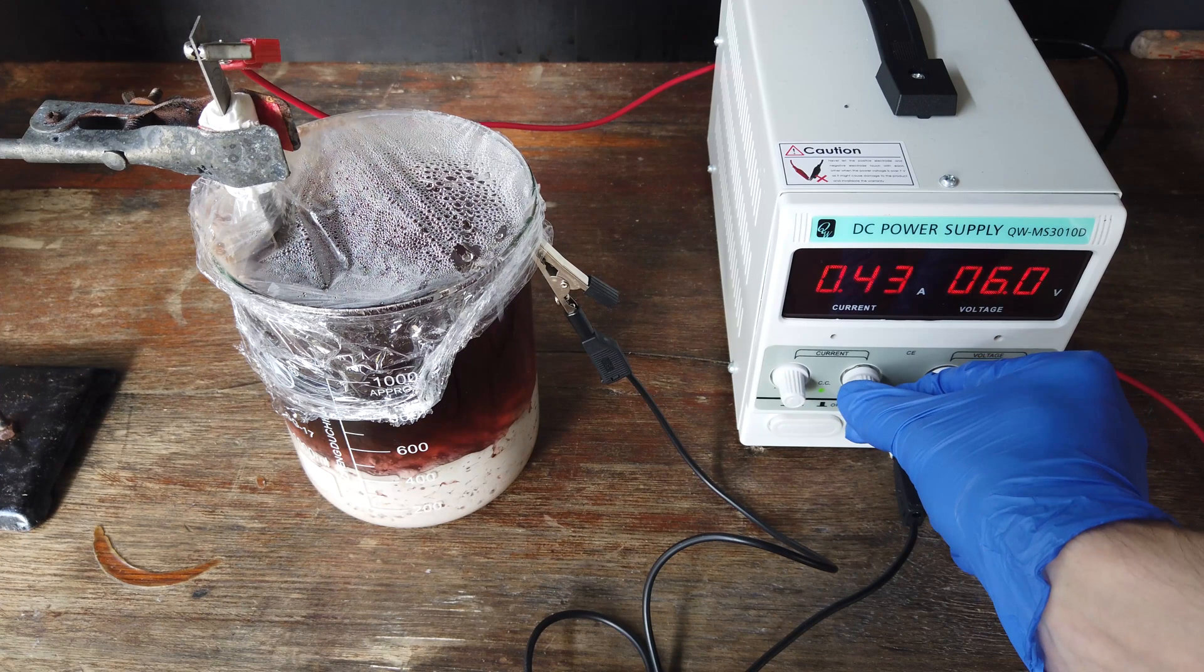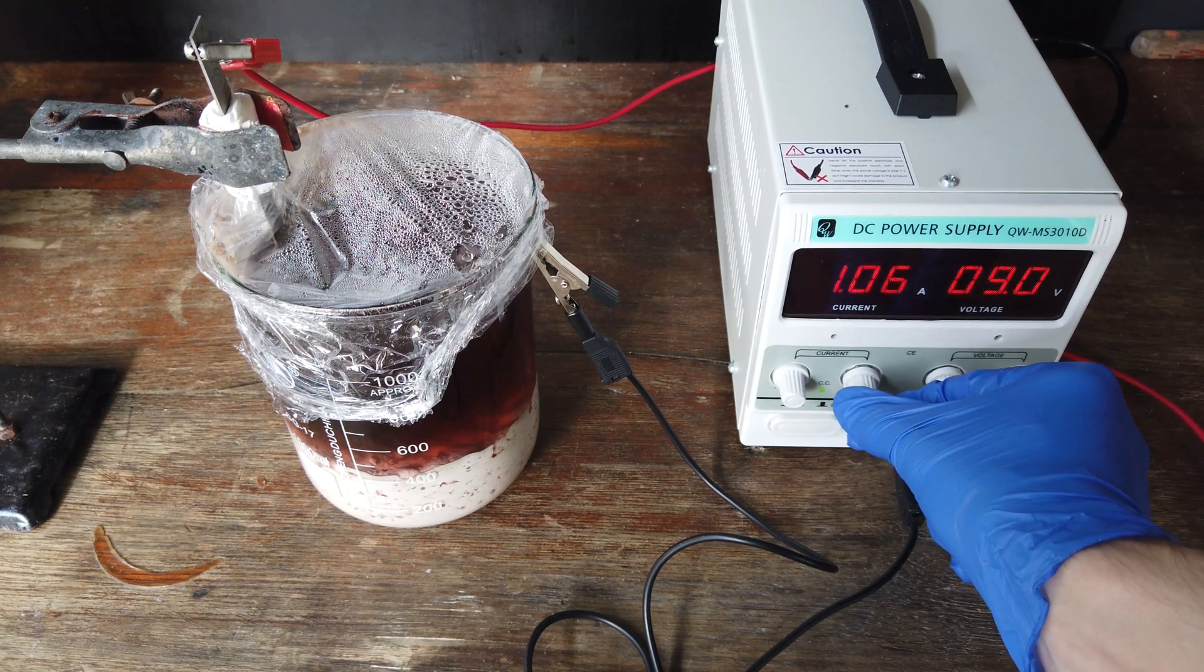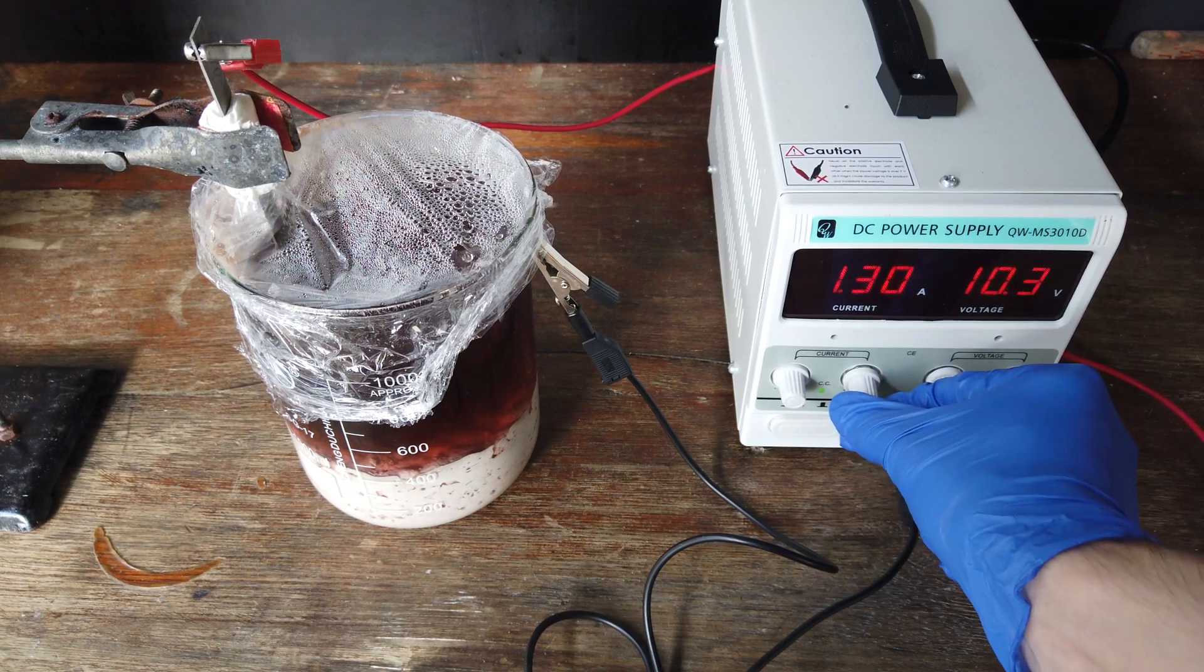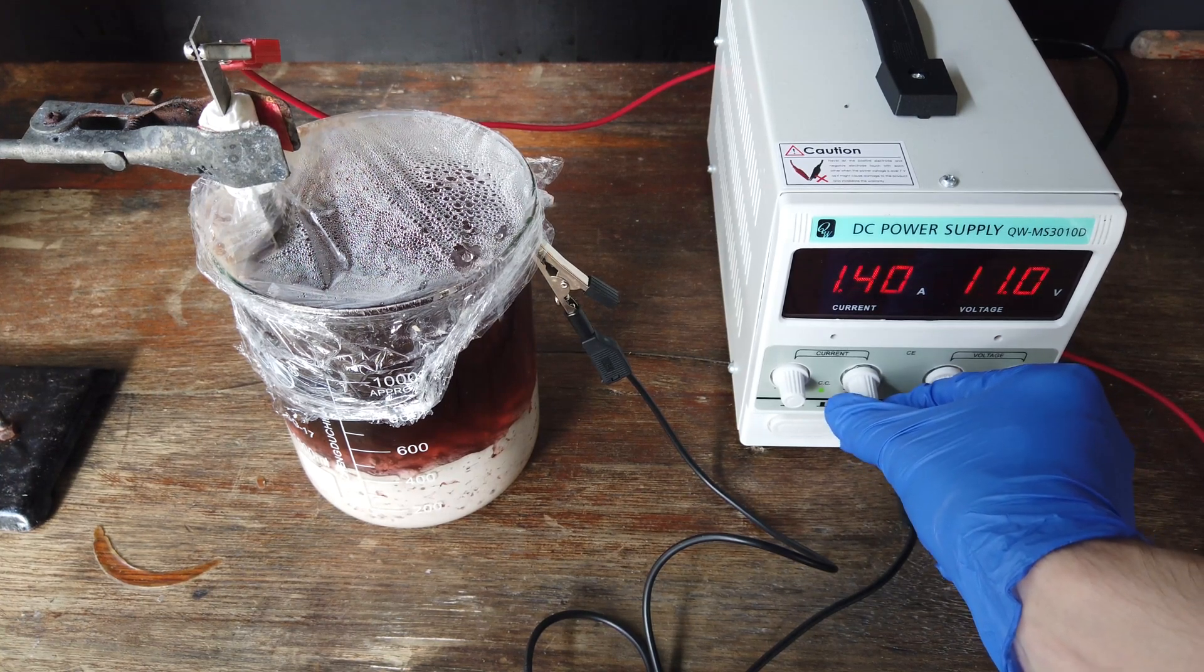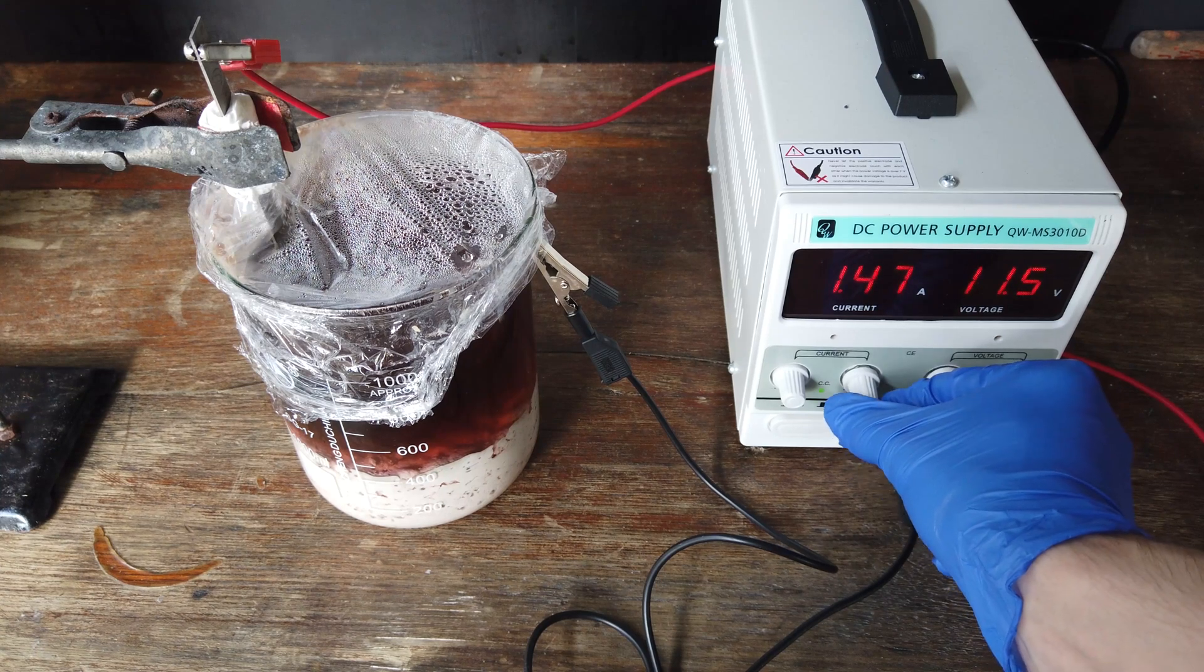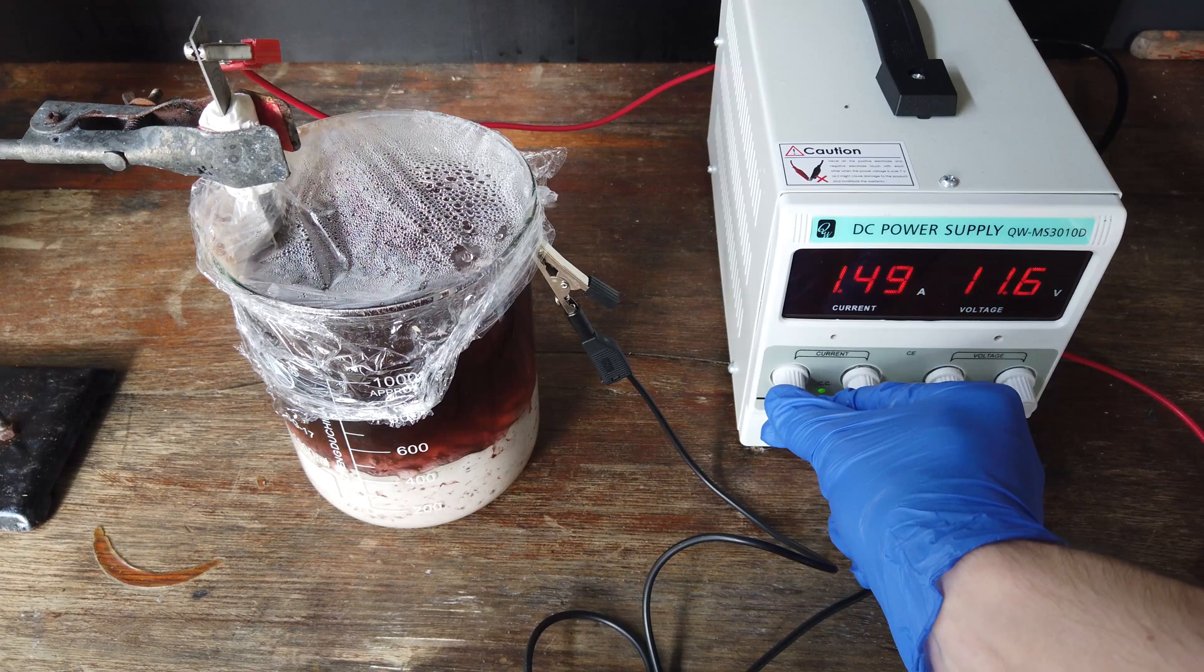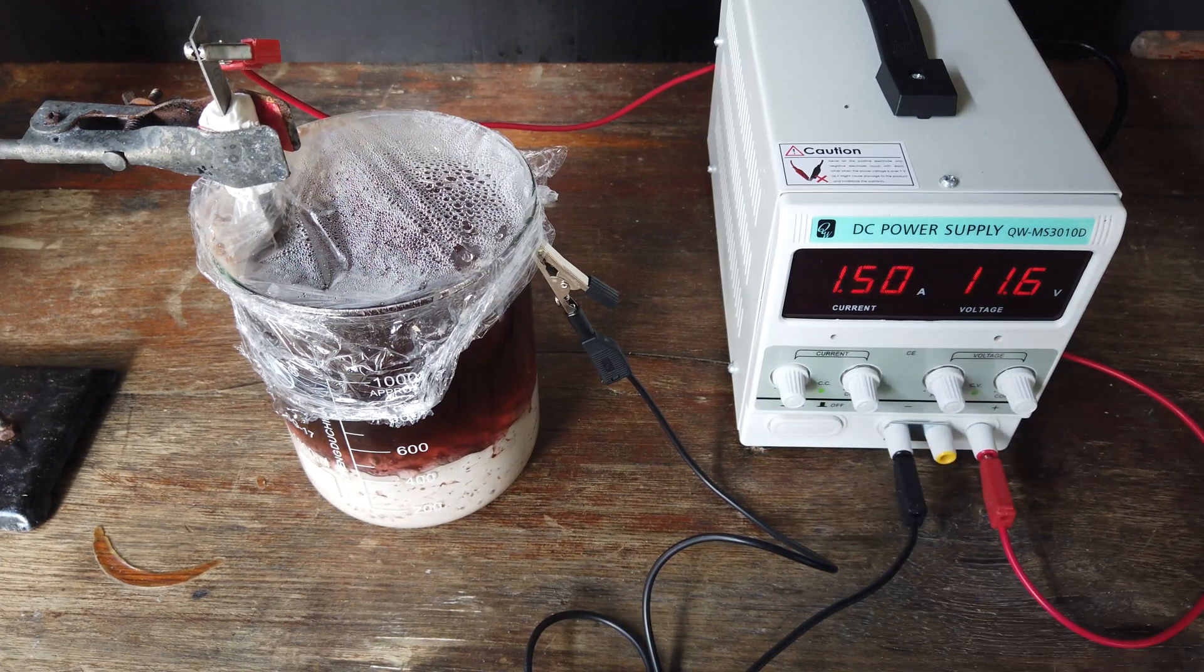What we actually need to do now, I think, is increase the current density. Because this will try at least to favour the reduction of metal ions over the reduction of hydrogen ions here. So, I'm going to increase the current all the way to 1.5 amps. And that's where we'll leave it.